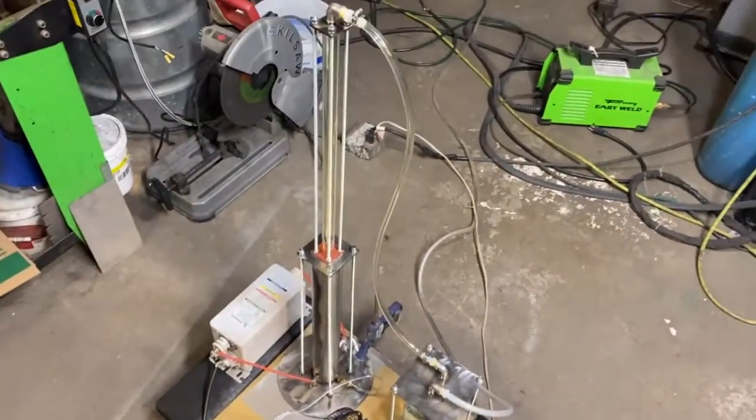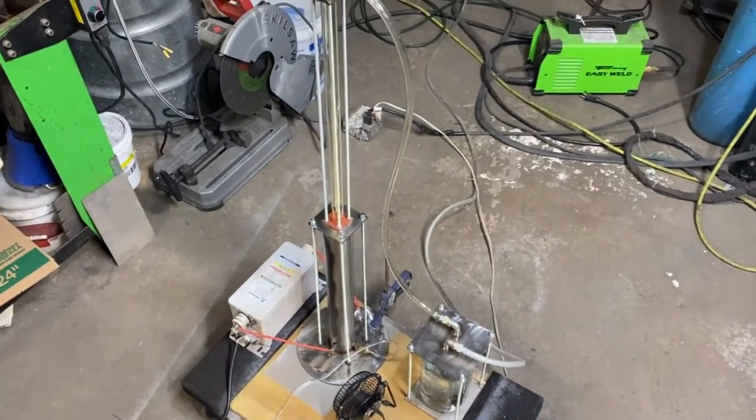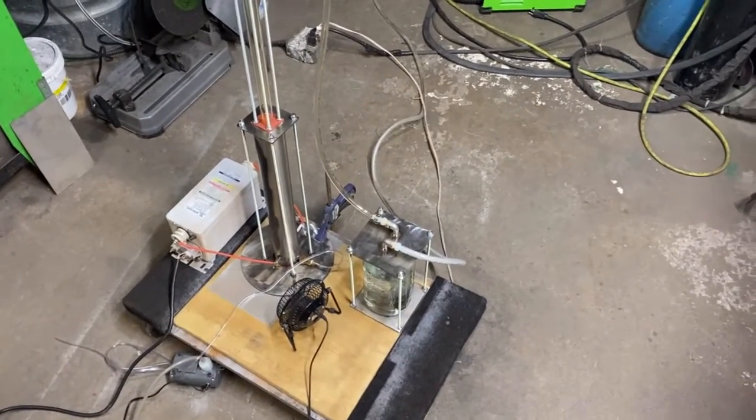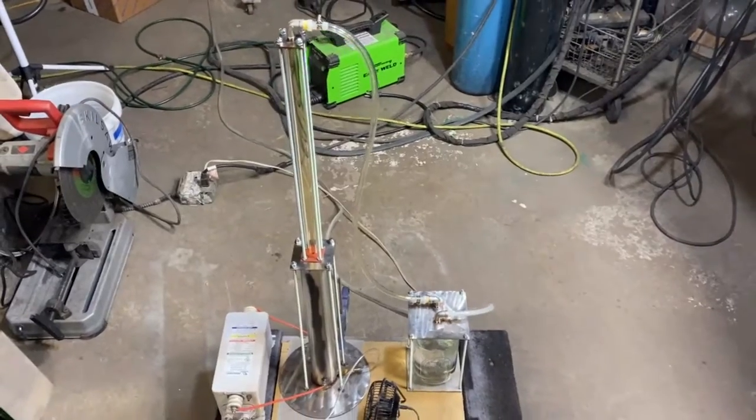I can't describe to you the joy of having this thing running. I feel like I've got a slot machine going in the background, even though it's costing me money in electricity. I have ideas of hooking this up to a windmill or a solar panel setup.